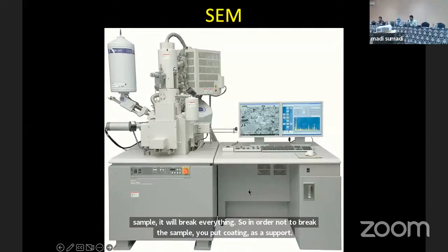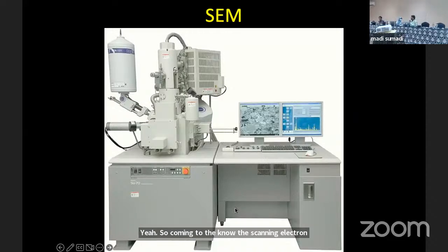So coming now to the scanning electron microscope, I think you already saw that one here. It's working very well. Yusuf is a very nice technical guy. You see a lot of nice, wonderful surface structures. The name itself says scanning electron microscope. It does not go through the tissue or the cell; rather it scans the surface, that's the major thing. Once you scan it, then you see the surface.